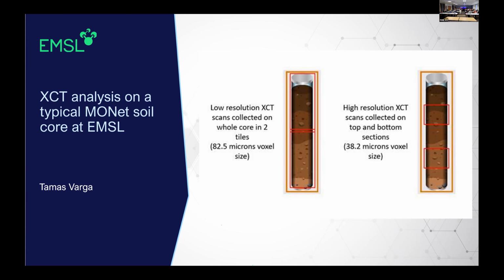As you will see in the data tutorial, for the MONet cores, we focus on the porosity, but we do have plans to create workflows if necessary, and if the project problems and questions warrant, we can try to segment the roots as well. Thanks.